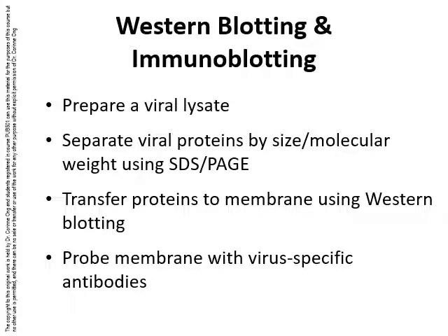Before it can be carried out, the separated proteins need to be transferred to membranes which enable them to be probed more easily, as polyacrylamide gels, being gel-like in their consistency, can dry out with time and are quite difficult to store. The protein bands also start to diffuse once the current is switched off, so the gel needs to be fixed in alcohols, which can denature the proteins, causing antigenic properties to be lost.